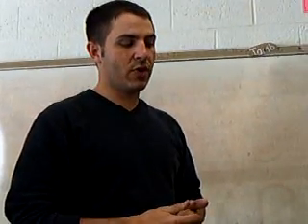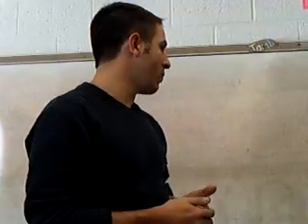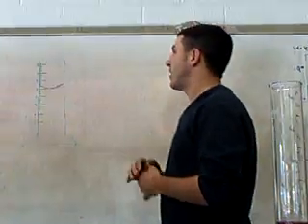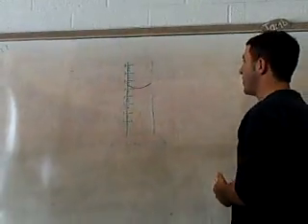What I've done is I filled the graduated cylinder here with some pink liquid, and we're going to look at how to read it. The key to reading a graduated cylinder is what's called the meniscus, which is here.